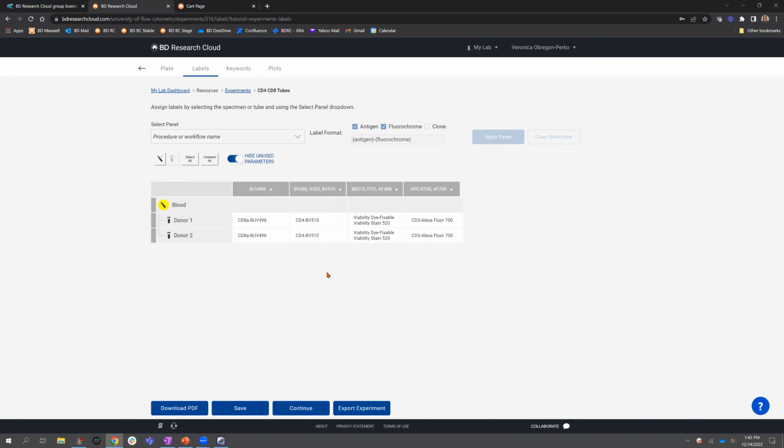Another way to think about this functionality is, let's say you don't need to design any panels, because all your panels in your lab have already been designed. Then go ahead and just upload them anyway to the panel design process. Pick all those colors that you already use, and that way you can make use of this functionality very quickly. So imagine being able to make Diva experiments in a matter of minutes, just by applying labels to panels that we're already actively using in the lab.